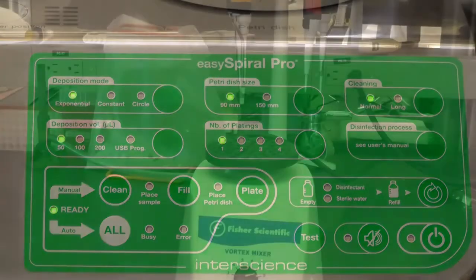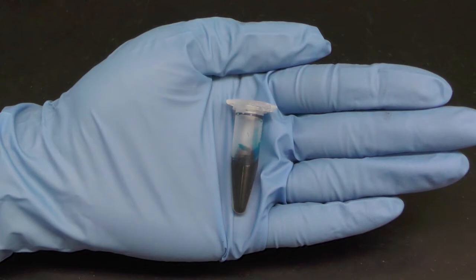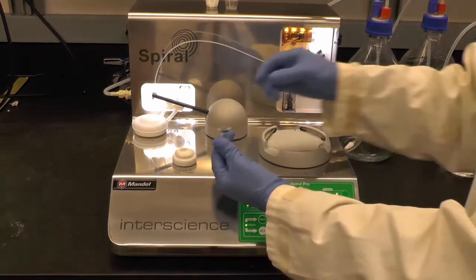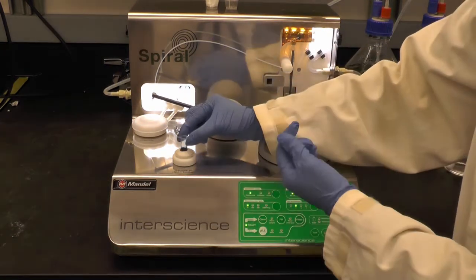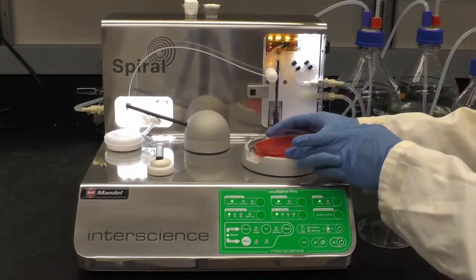Vortex your sample and transfer an adequate amount to a 1.7 milliliter eppendorf tube. Set the eppendorf tube onto the sample holder making sure the applicator tube can be fully submerged.